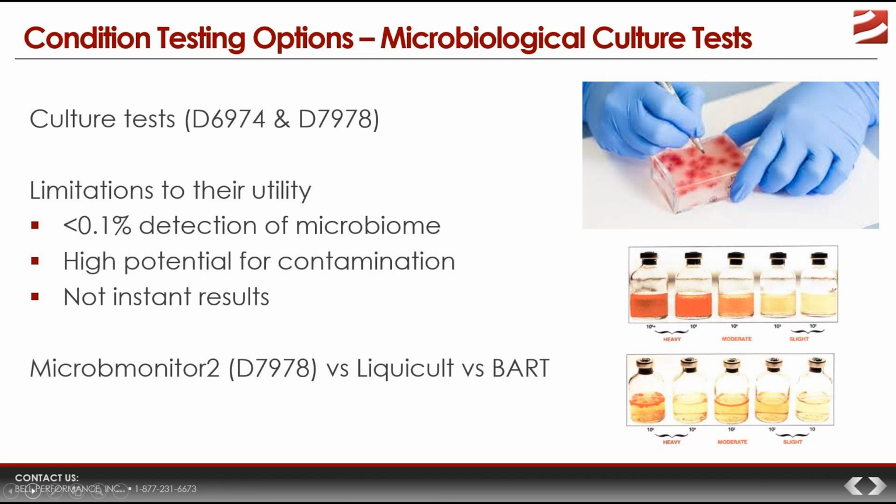Now, for those looking at commercially available culture tests, there are some options, some of which are better than others. One that we don't have on here is the paddle slides, the dip slides, because really I'm trying to think of a nice way to put this, no self-respecting condition monitoring or fuel maintenance program is going to use paddle tests. They're just too problematic.